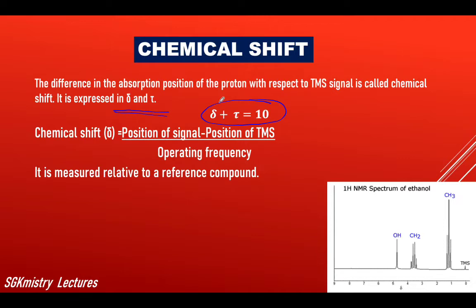So what is meant by chemical shift? Chemical shift is nothing but the difference in the absorption position of the proton under study with respect to TMS.